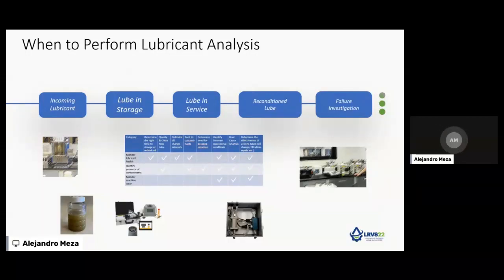What we want to obtain with all of these resources? Well, certainly to optimize the lubricant life, to optimize the lubricant performance. We want to maximize the machine life, maximize equipment reliability. Oil analysis and grease analysis is a great resource, with this broader perspective, to our reliability program.